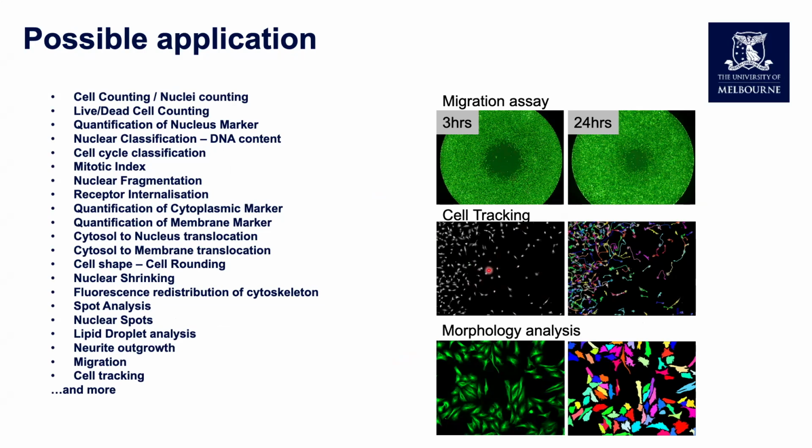We've done experiments over time where we can track cells, again, looking at kind of chemotaxis type experiments, or we can look at morphological analysis. So, what happens to cell shape after different treatments, gene knockouts, drug treatments, that type of thing. There's a really long, large list of things on the left-hand side there that you could do with these high-content screening systems.